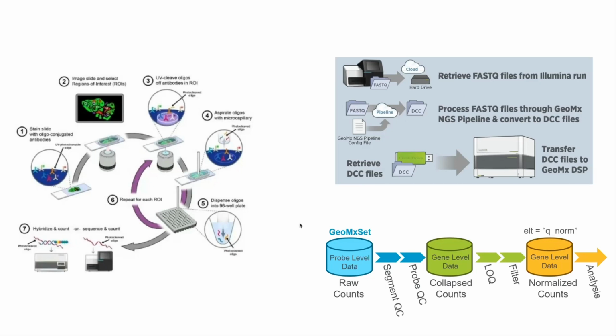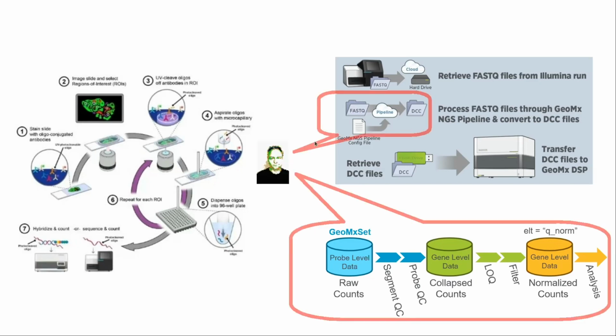And this is something that we do in close collaboration with the investigators of the experiments. So I'll talk a little bit about the process of going from the sequence files to the count files, and then I'll go through what is the content of this analysis procedure.